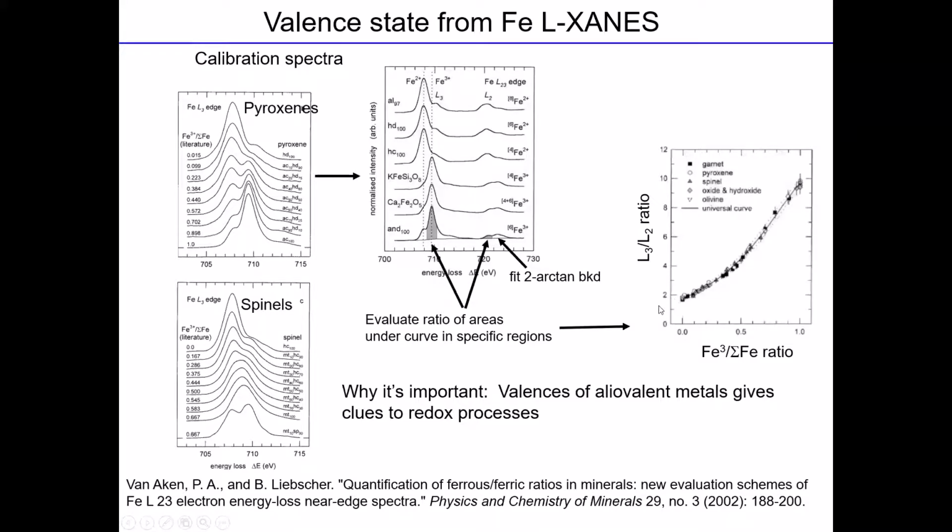And the cool thing about this universal curve is that it works for a wide variety of minerals. So it works regardless, and you don't need to calibrate for each and every kind of mineral you have.